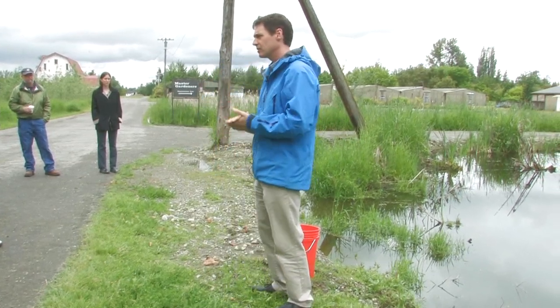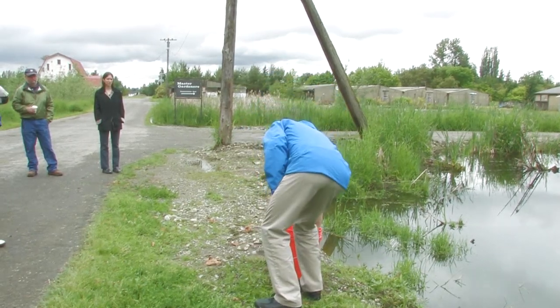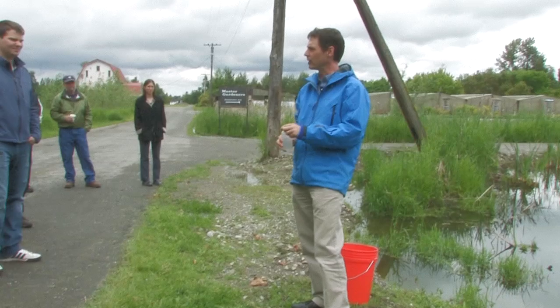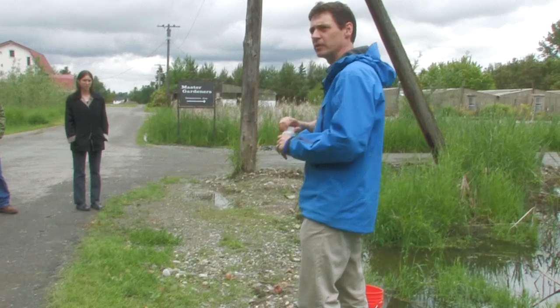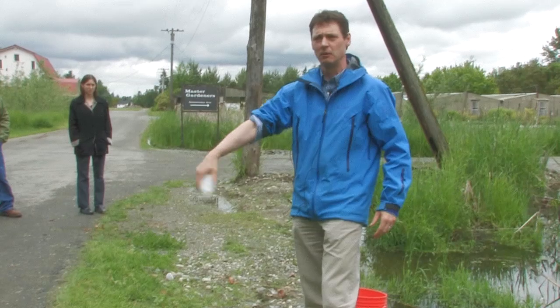I'm going to start this demonstration by showing you what not to do. First, I'm going to grab this bottle I found next to my desk. This is what I use to water my plants every day — I go right into the kitchen sink and grab this bottle. I'm going to take this bottle and use this for sampling. I'll put my cap right there and dump out this water I've been using to water my plants.